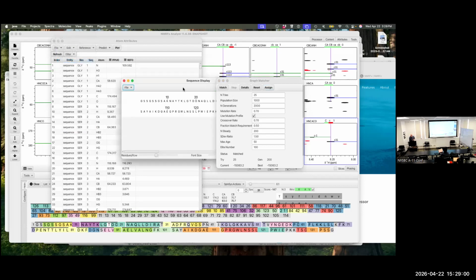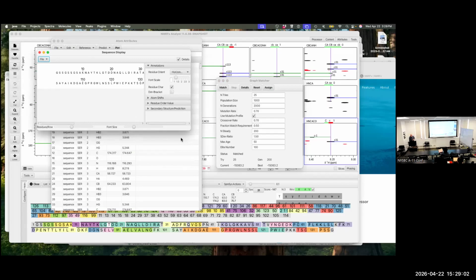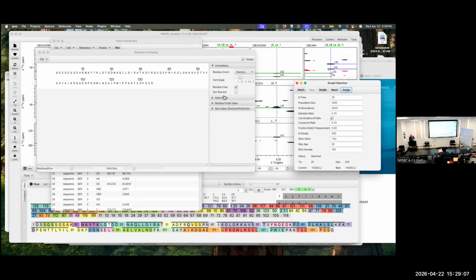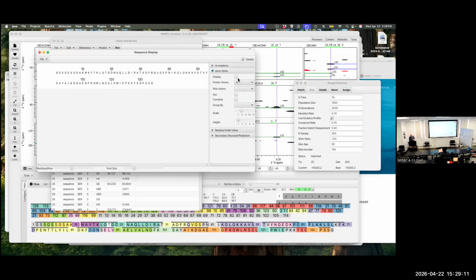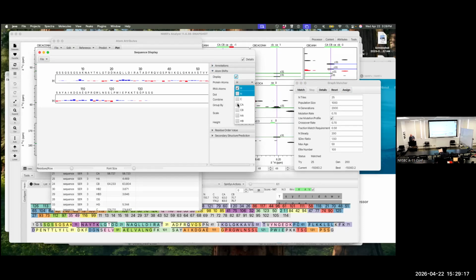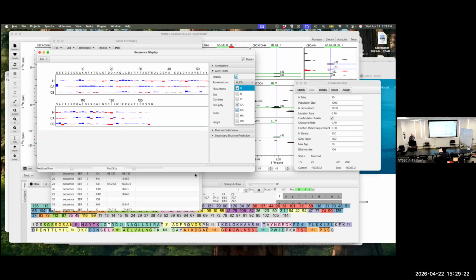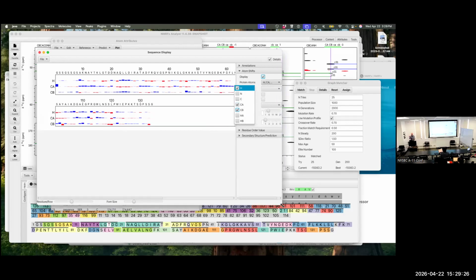We go to the sequence viewer. We can do lots of common little things. This looks for RNA or protein. We can choose different atoms, and so we can get a deviation of the assigned chemical shift relative to average values, which indicates helix or sheet.